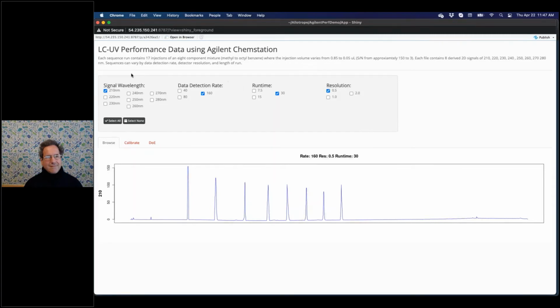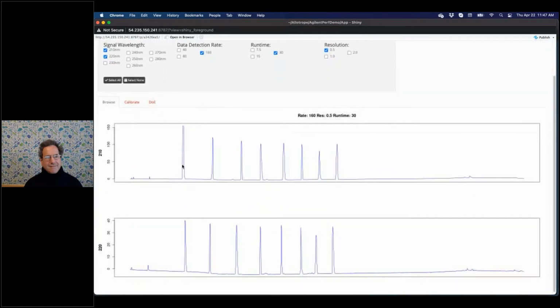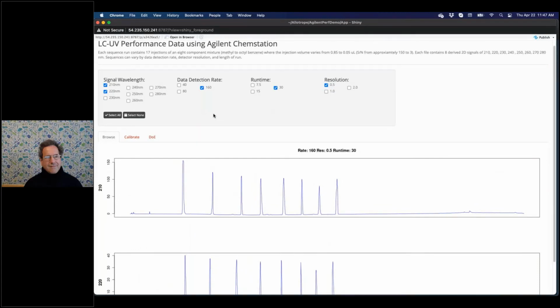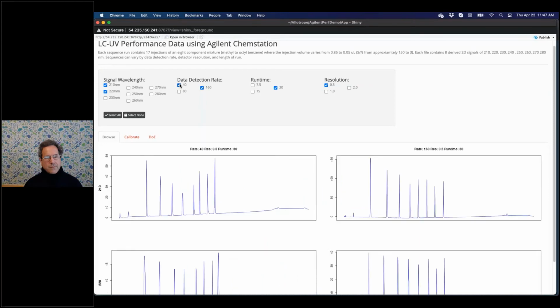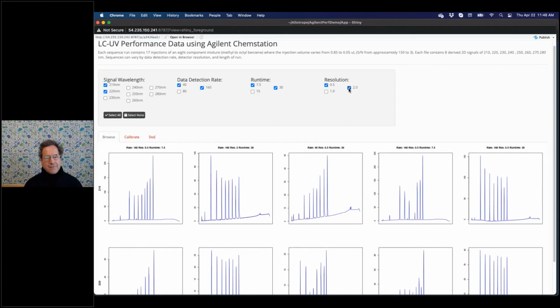In this panel here, we see all the different parameters associated with the data. As we make selections, these different waveforms get updated and displayed, with the different wavelengths as the rows and the different detector rates as the columns. We found interfaces like these really allow users to quickly inspect and explore the data. By hooking into SciDB as the underlying layer, such GUIs become really efficient in terms of time spent extracting and displaying the data.